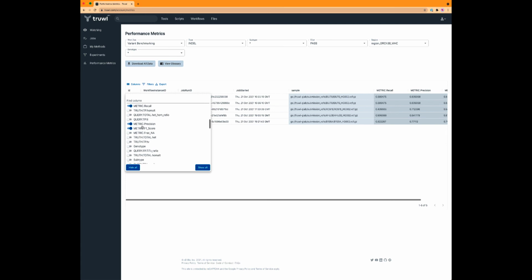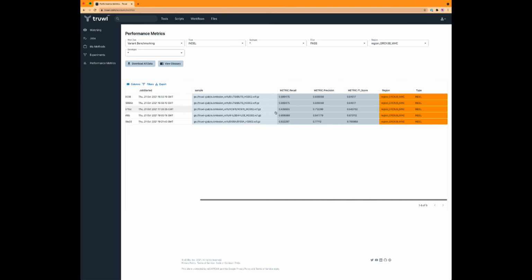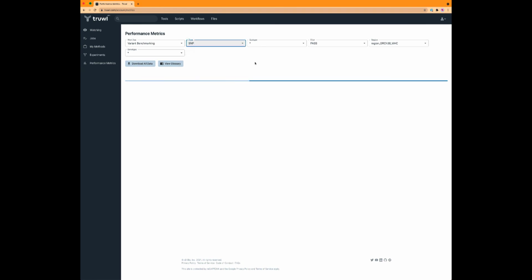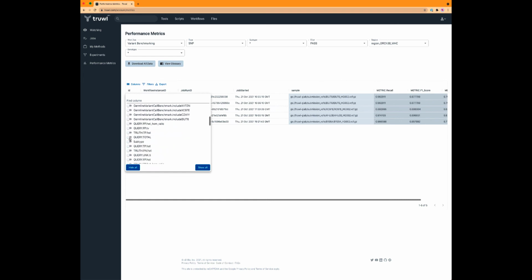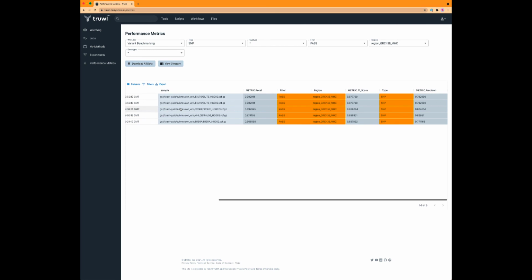In the display, all the inputs of the workflow are available as columns, and individual metrics, which appear in dark gray, are aggregated from individual runs. Finally, facets, which distinguish repeated measurements across different criteria, appear as orange columns. The table itself can be downloaded as a CSV for subsequent analysis.